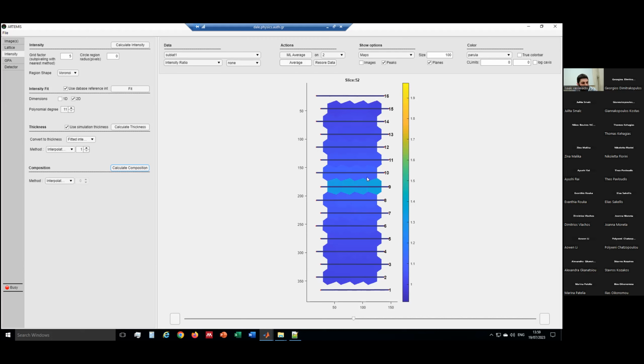Thanks. So it's a nice example that these nitrogens are visible when they are connected to the indium, but they are not visible when they are connected to the gallium, showing how the local environment can influence the composition that you are seeing. So this is why you need the image simulation. Exactly.